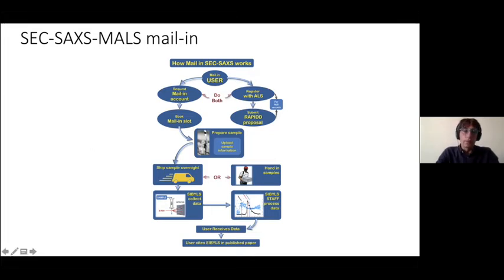You upload your information, you ship the sample or hand it to us. And during the COVID time it was much more difficult to hand over samples, but we've still been able to go out the gate and ask you to meet us out of this LBNL gate if you are local. We collect the data, analyze the data, you receive the package, and you publish and you cite the SIBYLS Beamline.